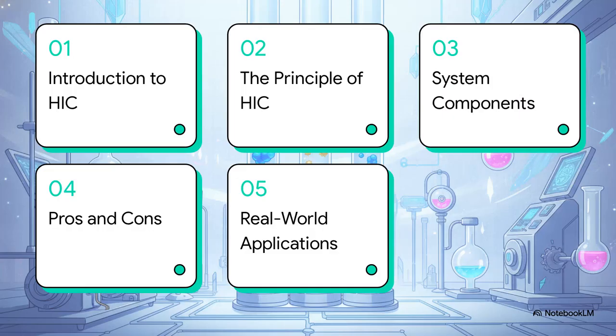Here's our syllabus for today's masterclass. We'll start with a quick introduction to HIC, dive into the core principle, look at the system components and workflow, weigh the advantages and limitations, and finally, wrap up with some real-world applications.